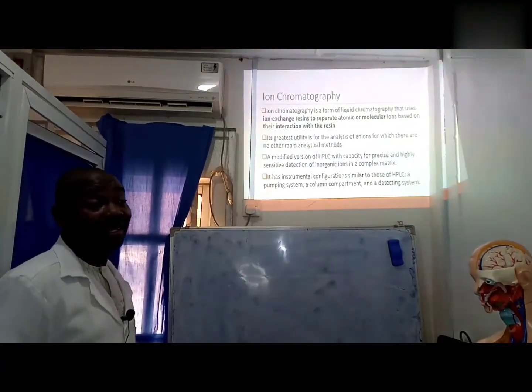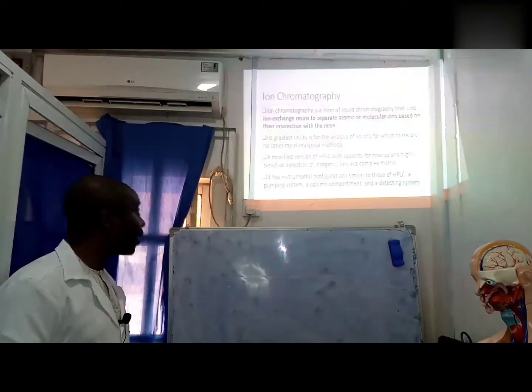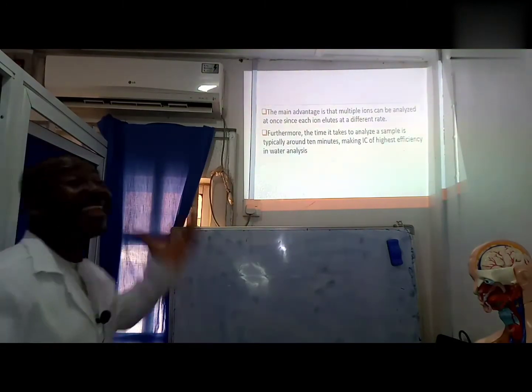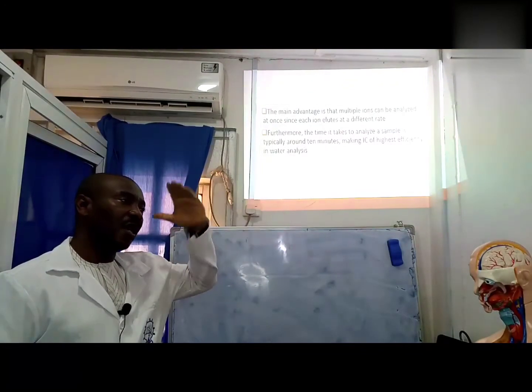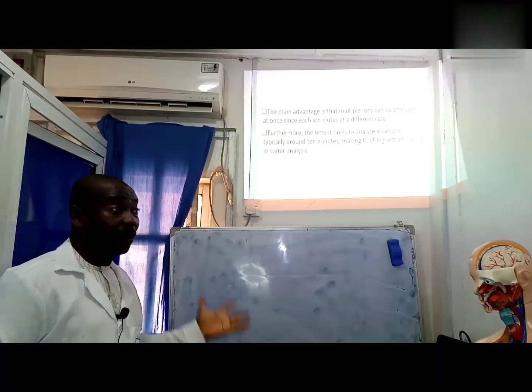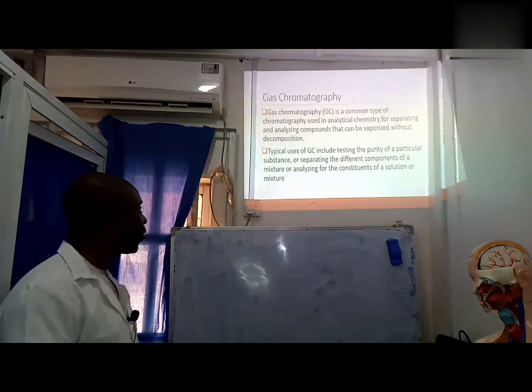It just works like the HPLC. It's a modification of HPLC. The main advantage of this is that multiple ions can be analyzed together. So in one result, you can see the cations, anions, and all of that, the organics presented, and it's quite interesting to use.